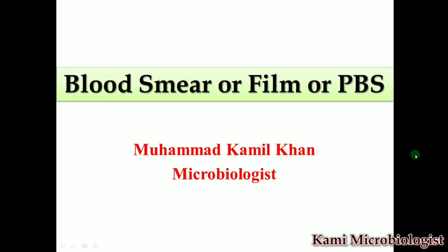Today, in this video lecture, we are going to see the blood film, which we also call the blood smear or peripheral blood smear as well. In short form, we can say PBS. So let's see what is actually a blood film, blood smear, each and everything.